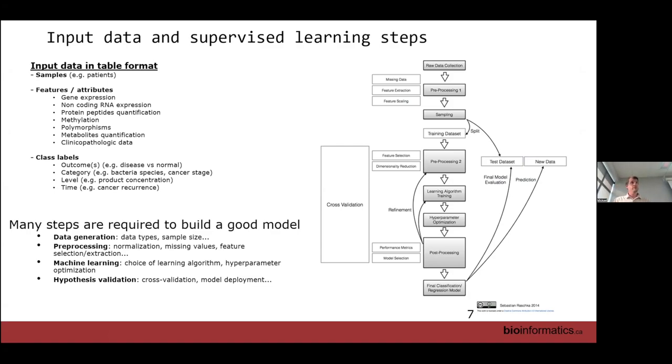And at the end, when you have something robust, then you take new data, you come back to the lab, and you submit that to the model, and you check if it's still accurate.